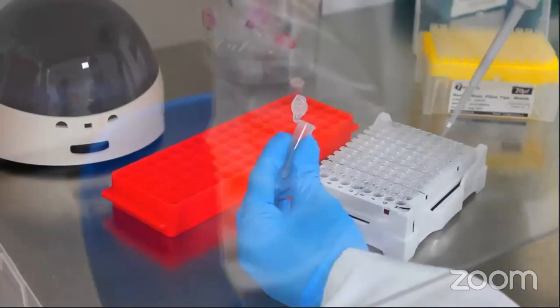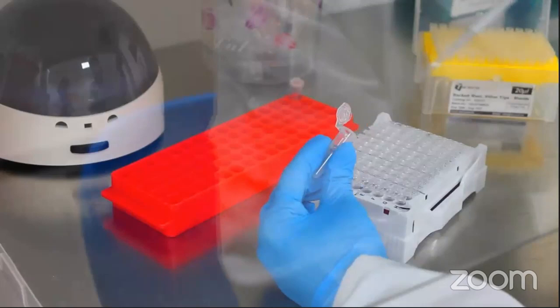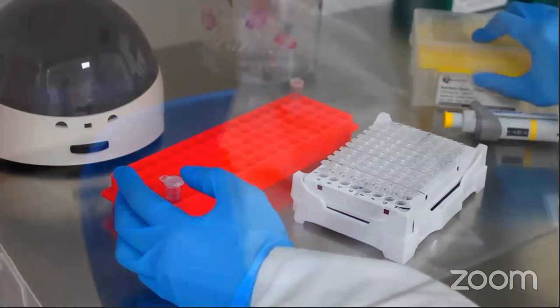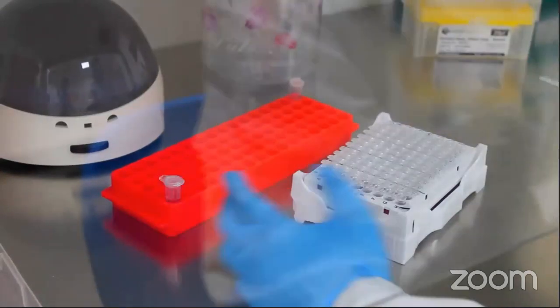So we have dispensed the master mix in the whole of the 96 wells now. Make sure that all the wells have the master mix. None of the wells have been skipped.